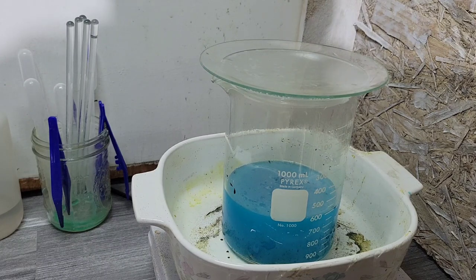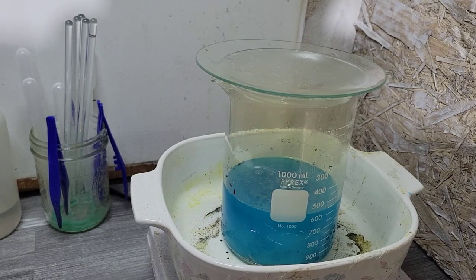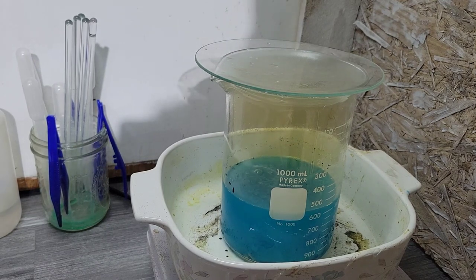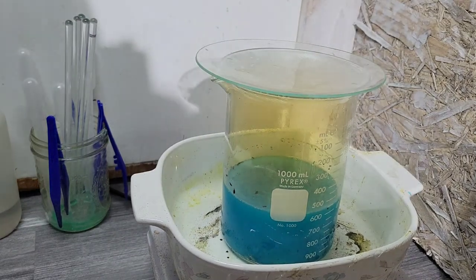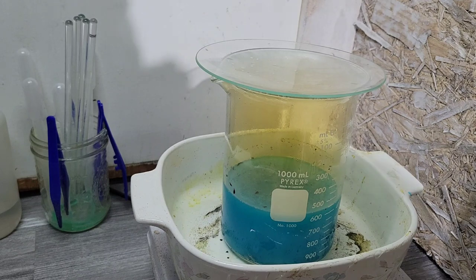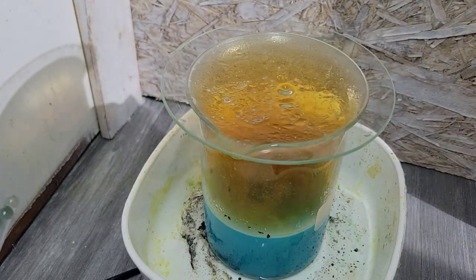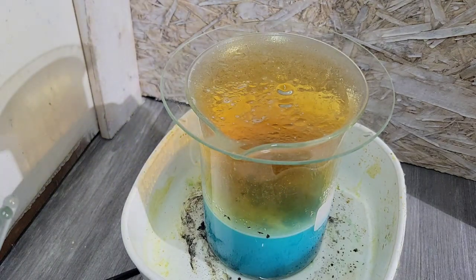Let that heat up a little bit more. And when that reaction starts back up, I will start recording again. Right, so I just added 50 more milliliters of nitric acid. Starting to get a reaction now. A different camera angle. So since I added the 50 more, we got a really nice reaction coming.